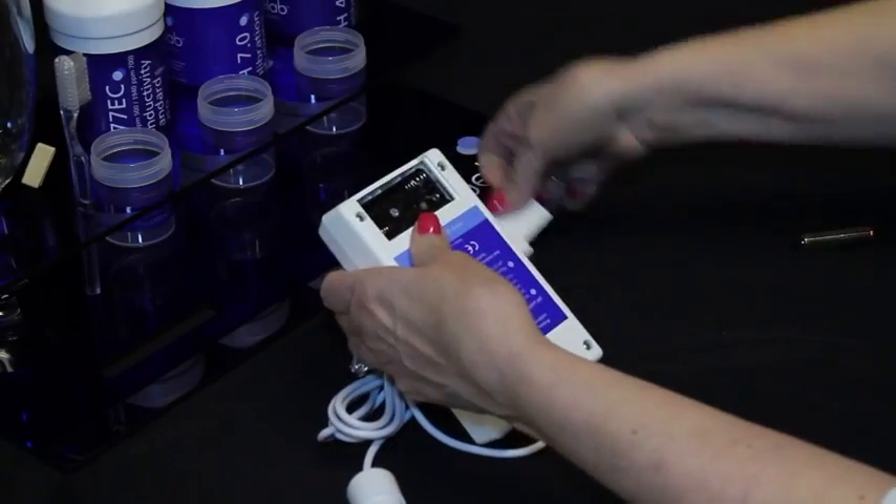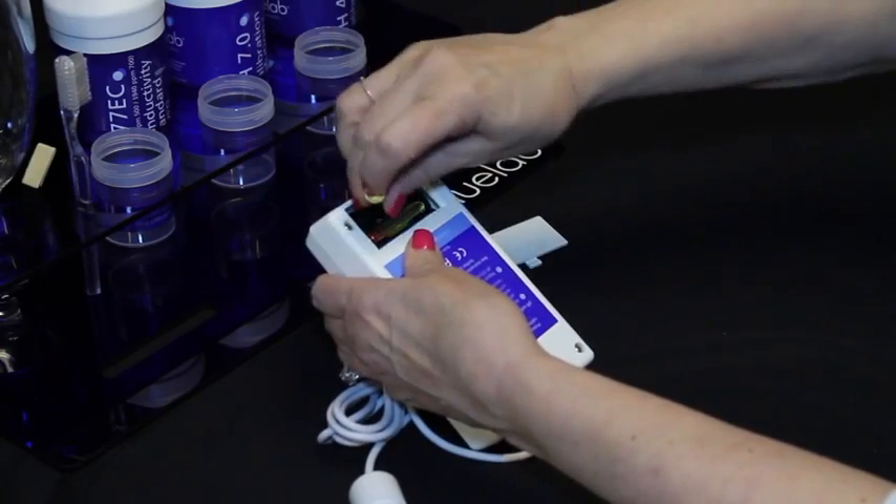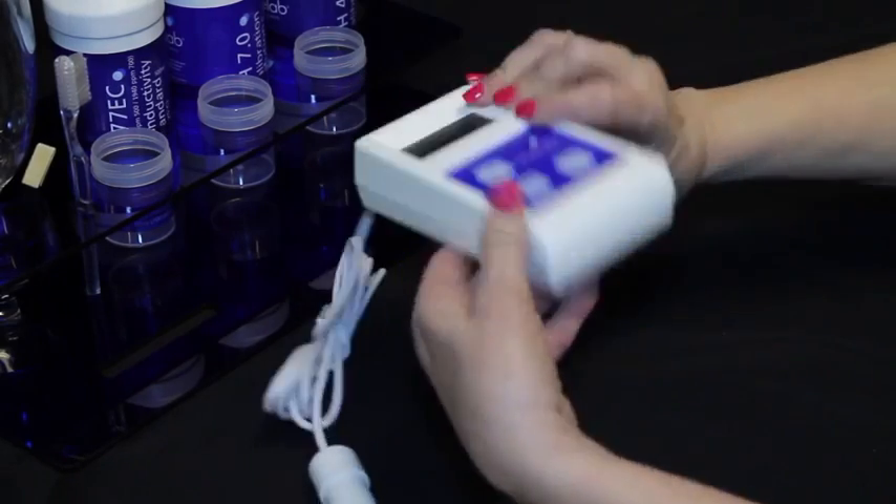Open the battery cover and place the supplied batteries in the compartment with terminals at the correct ends. Slide the cover back on. Bluelab recommends using only alkaline batteries.